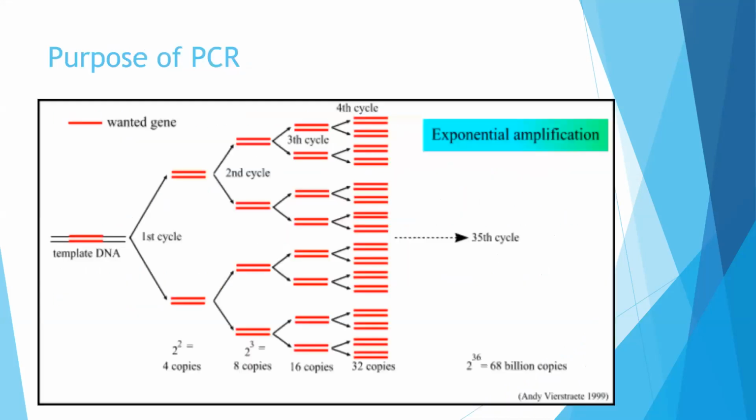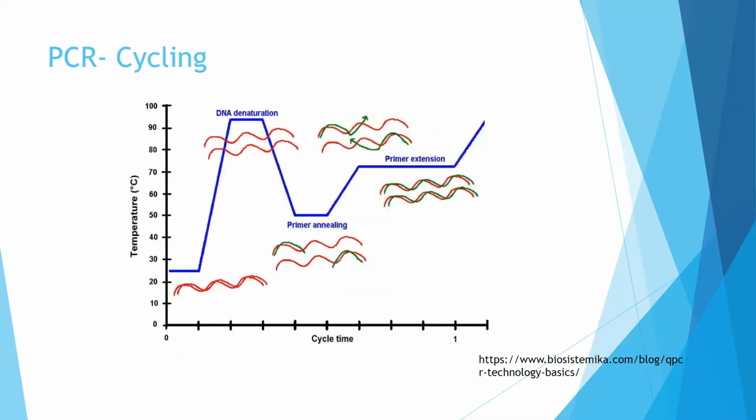Now we'll move on to testing. PCR stands for polymerase chain reaction, which detects genetic information of the virus. PCR is used to amplify DNA, so if you start with a small amount, large quantities can be produced through thermal cycling. Thermal cycling steps include denaturation, annealing, and extension steps.